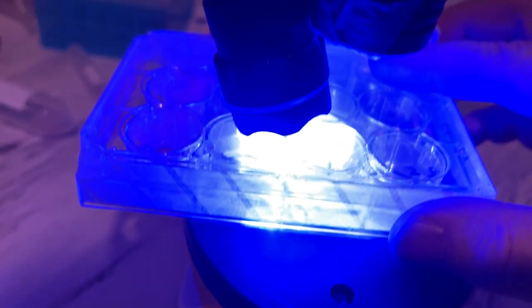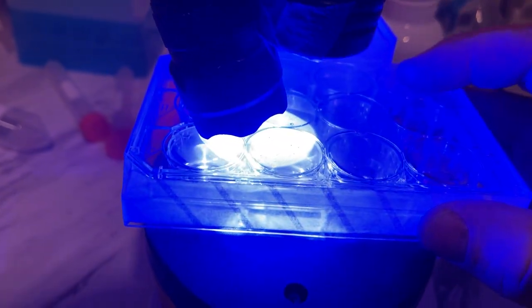Now, we can compare this to the next well over. Here's these cells. Now, here's an unmodified well. Make sure it's in focus. It's hard to focus. There's nothing to really see.